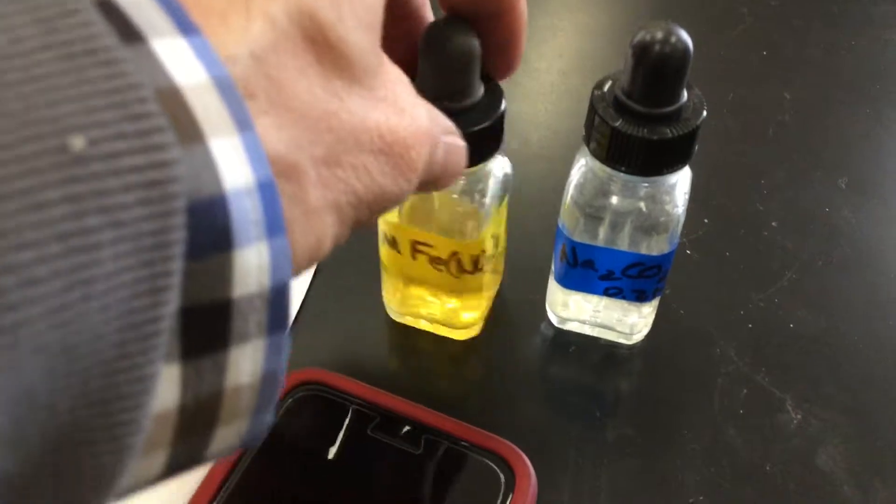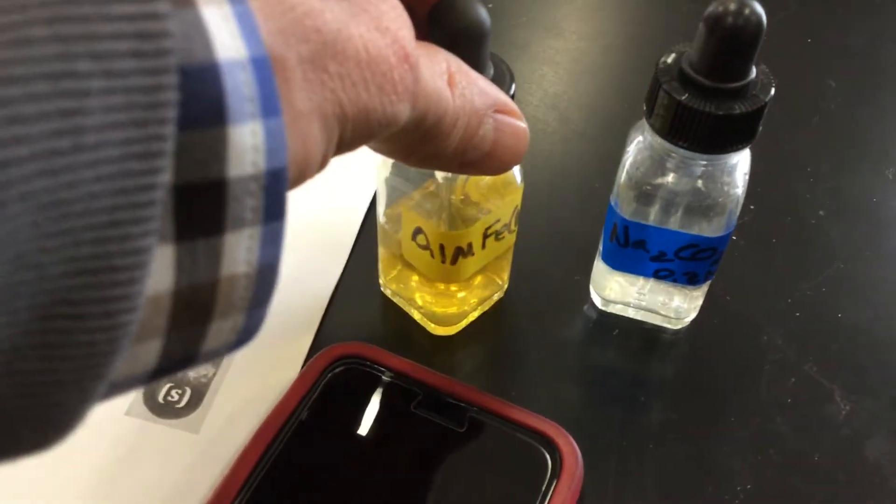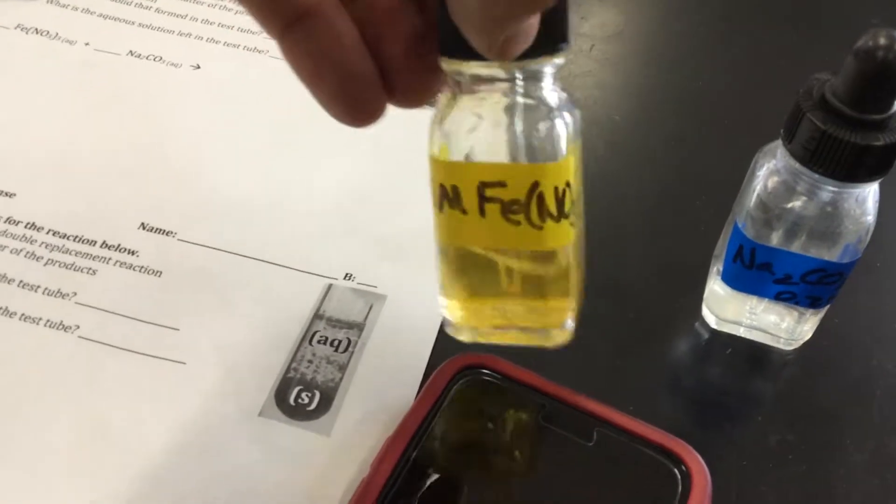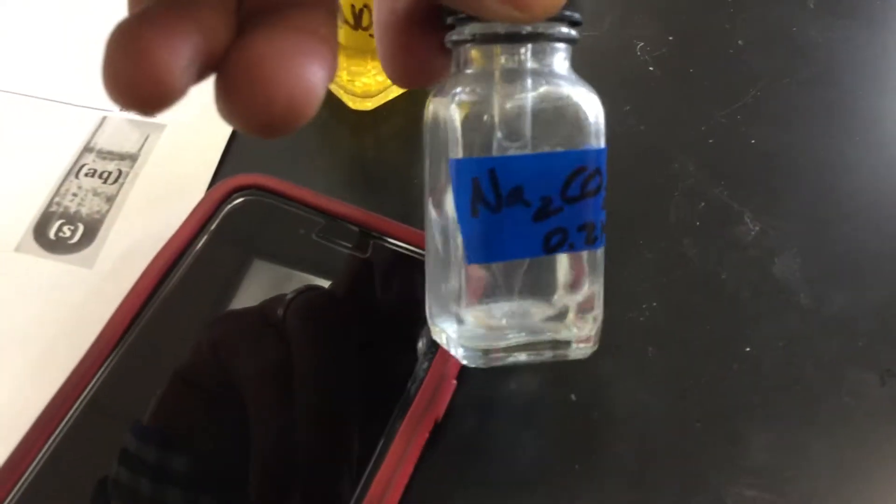So the chemicals that we have here today, let me turn these around so you can see them. We have some iron nitrate and you should know now that 0.1m stands for 0.1 molar. That's how concentrated it is. And then this chemical here, we have sodium carbonate. This you'll see is 0.2 molar. Now for your purposes, the molarity doesn't really matter, but I'm just going to mix some of those inside a test tube.